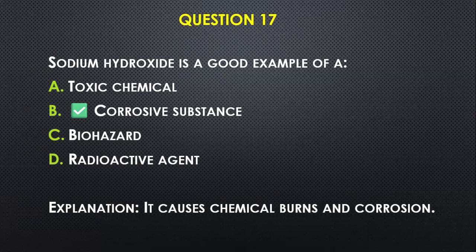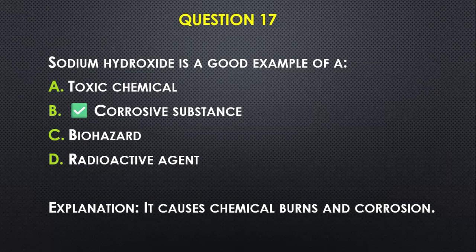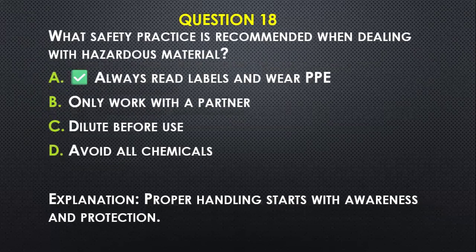Question number seventeen: Sodium hydroxide is a good example of — A) a toxic chemical, B) a corrosive substance, C) a biohazard, D) a radioactive agent. I will go with B — corrosive substance — because sodium hydroxide, whether in solid form or as a solution, causes chemical burns and corrosion.